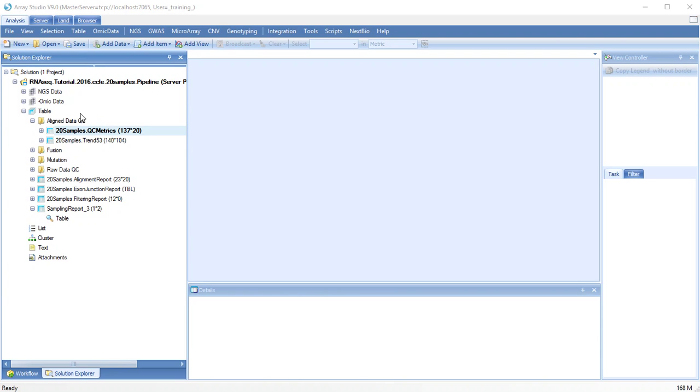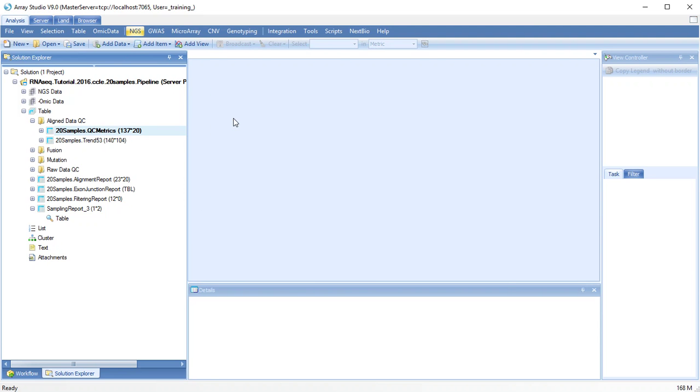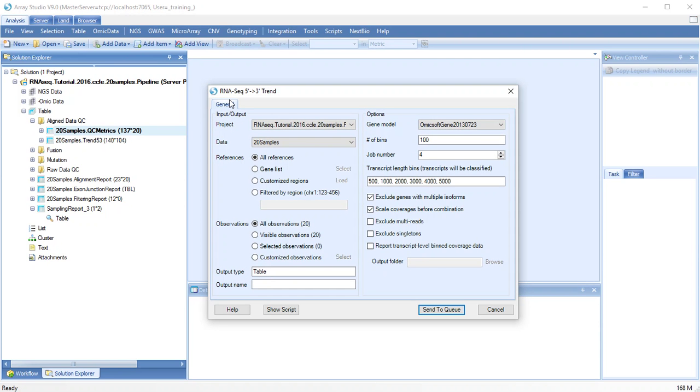For RNA-seq data, you can also check the coverage of genes along the 5' to 3' axis. For each gene in a gene length range, this module will measure what fraction of the reads along each gene are falling into bins, defined here. This can identify certain problems that can be caused by certain enrichment methods, such as poly-A selection.